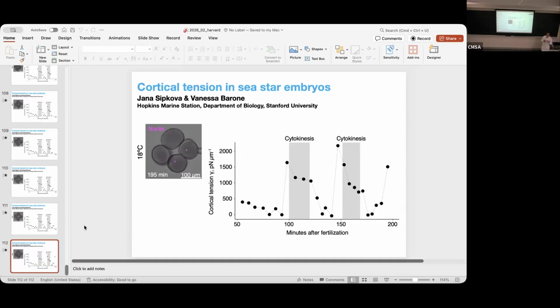We are thinking about ways to measure in other points, but it's a little bit more difficult because the curvature then is not that reliable. So the pole is an easy hallmark to find, and you know that you're measuring always in the same place, cell by cell. Let's say you want to measure next to the cytokinesis ring. You need to know where the cytokinesis ring is going to form in order to do that, and that's a little bit more tricky, technically speaking. But yeah, those are good questions.